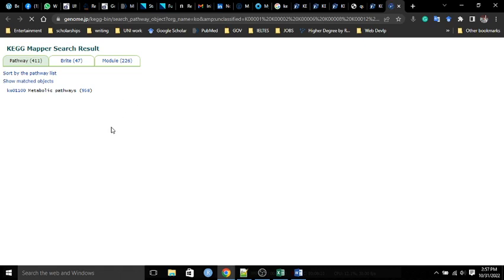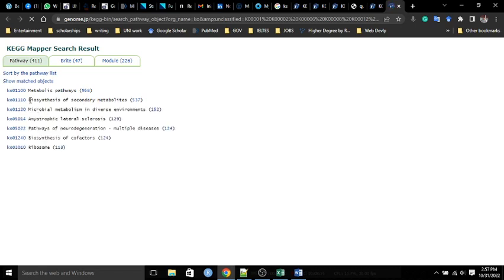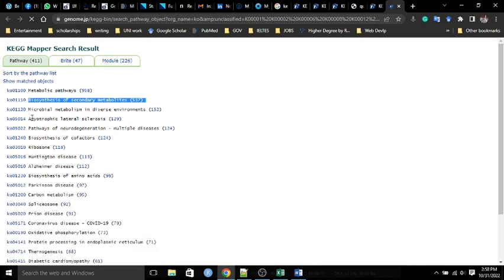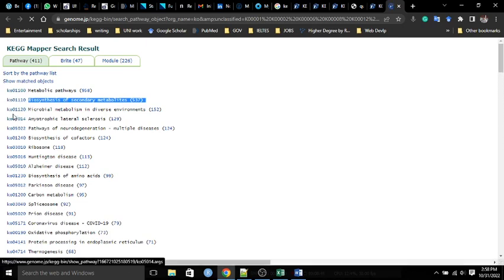So here we have a full result regarding our data. There are metabolic pathways which show coverage of 958 unigenes with our data. And there are many other pathways, like secondary metabolites and microbial metabolism in diverse environments. These pathways can be represented with specific IDs, but these are not KEGG orthology; it has a different meaning.